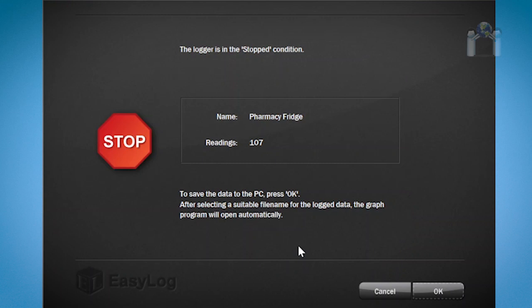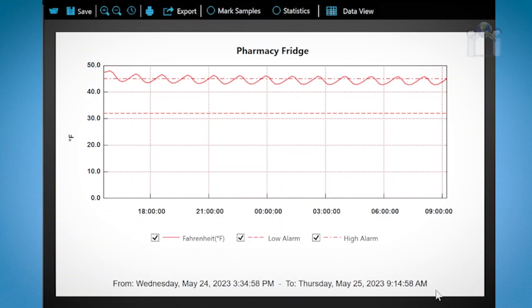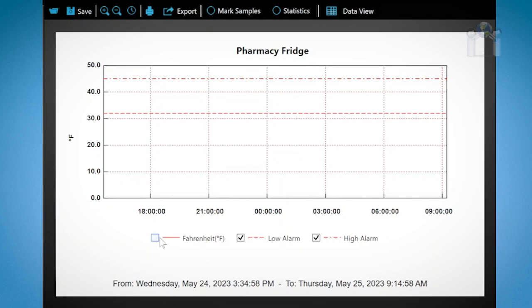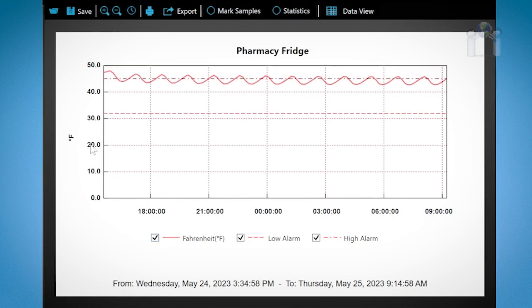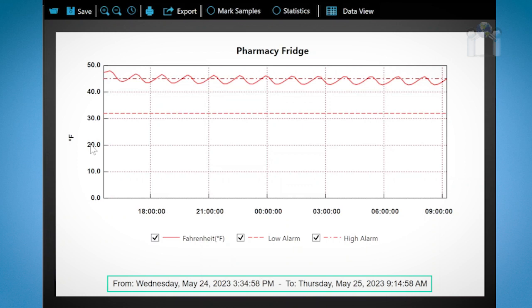Click OK and the download will begin. After a few moments a window with the graph will appear. Looking at the graph you will see three lines: the two differently dotted lines represents the high and the low alarm settings, the solid line represents the recorded temperature. At the very bottom you'll see the date and time range of data the logger was reading.